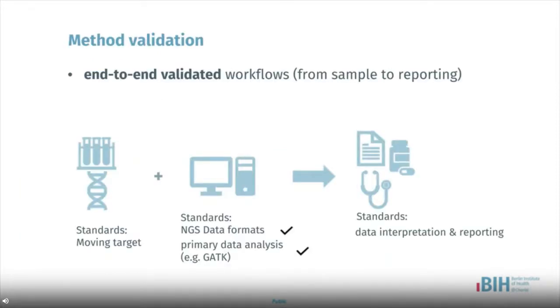In the clinical context, it is of great interest to implement workflows that include all steps from sample to medical grade report. These workflows need to undergo a thorough validation in order to ensure meeting defined standards. Yet, due to the fact that molecular assays such as NGS-based assays are in continuous development, a significant effort needs to go into validation of clinical workflows that are utilizing them.